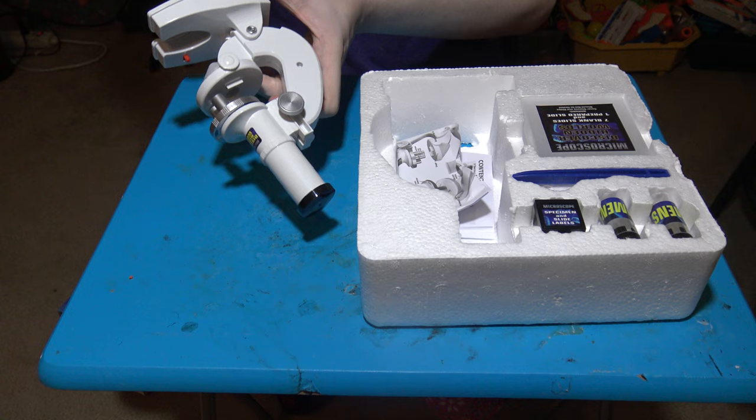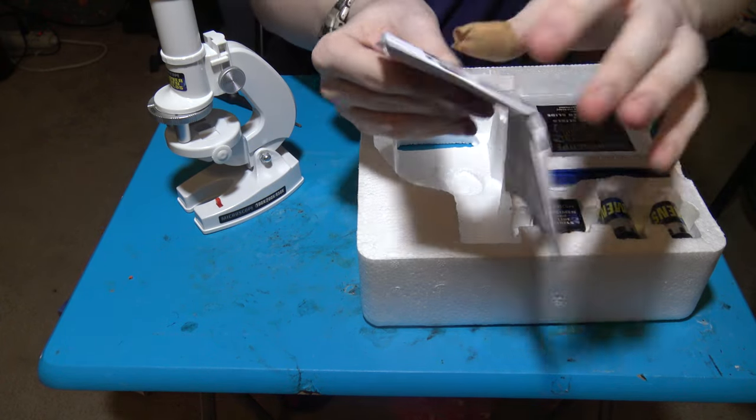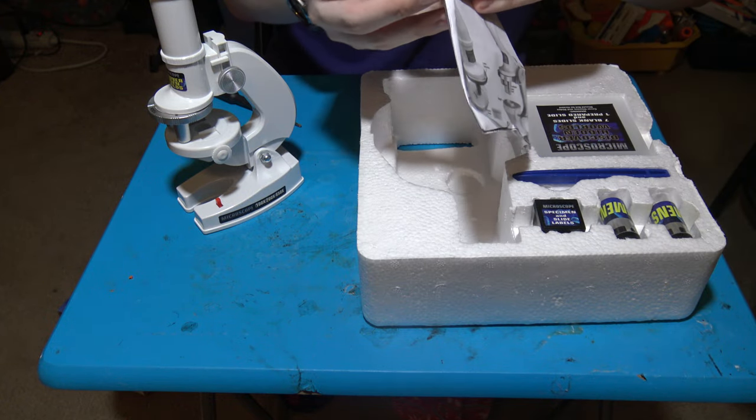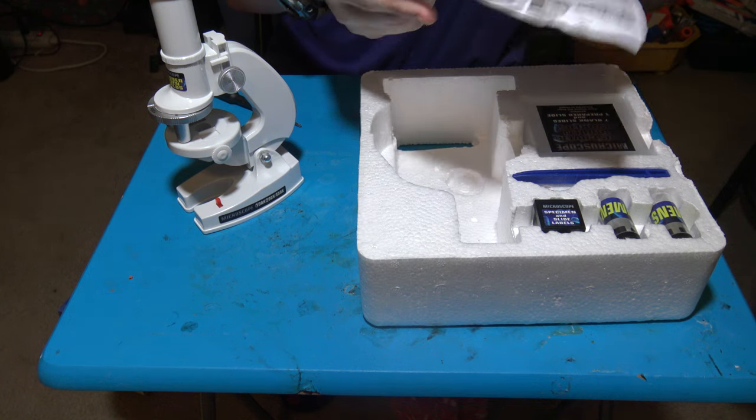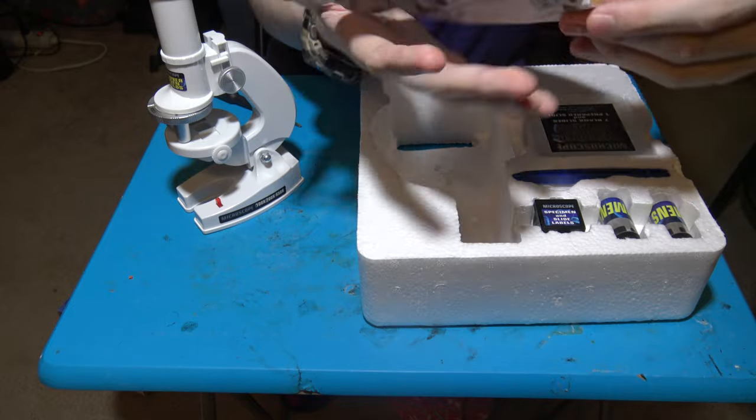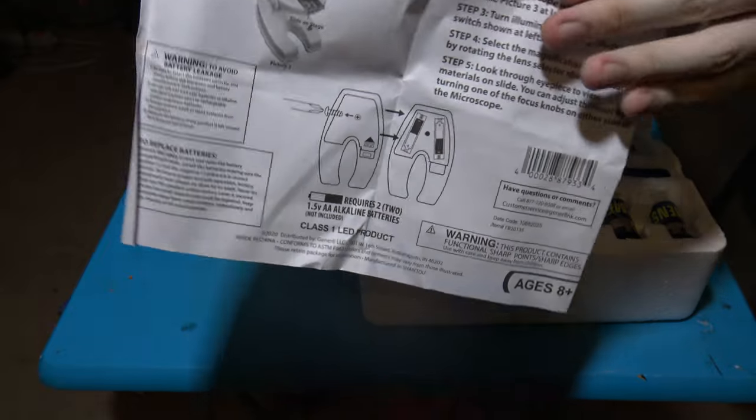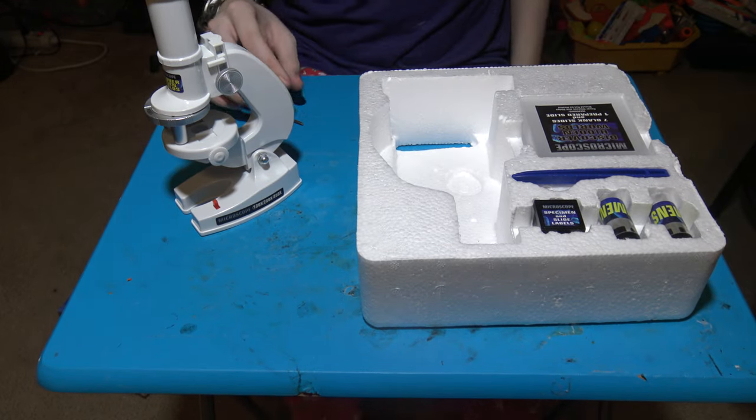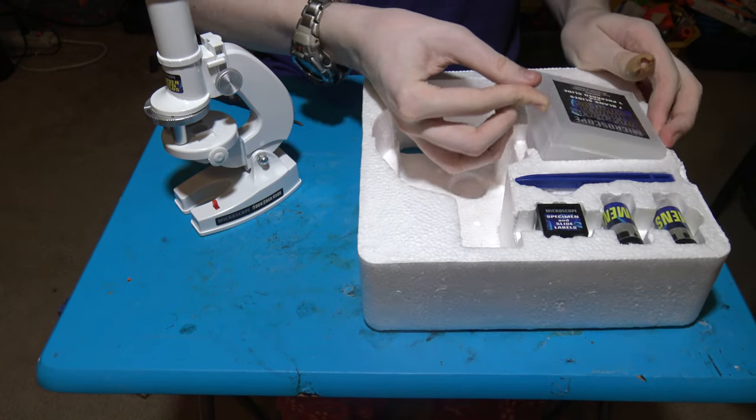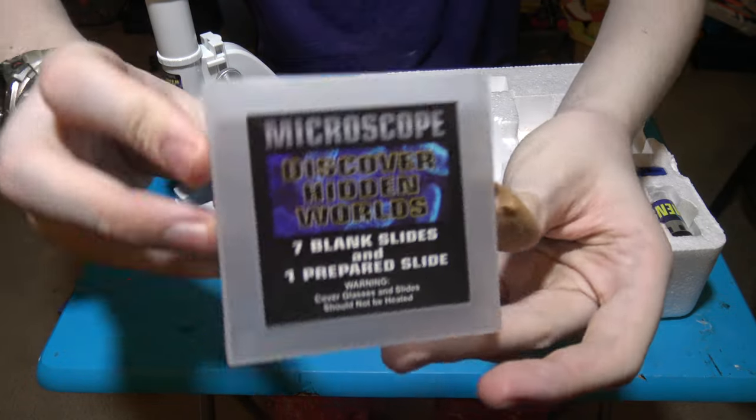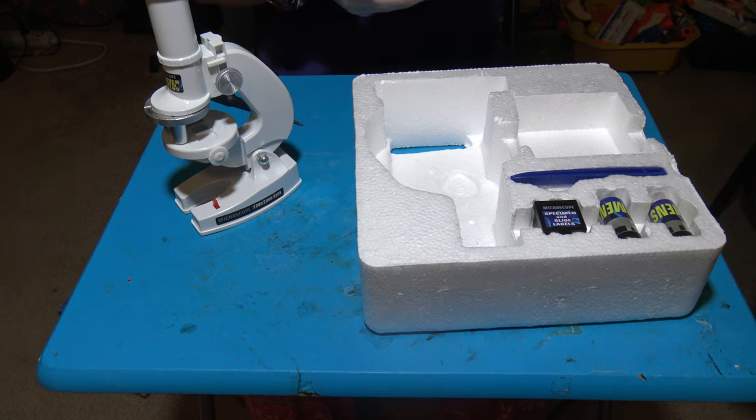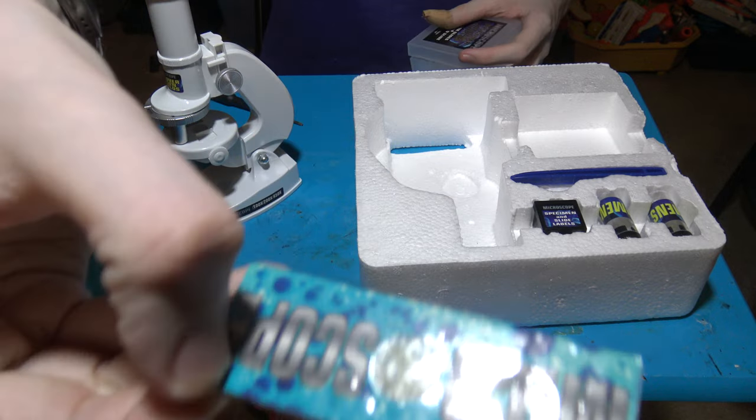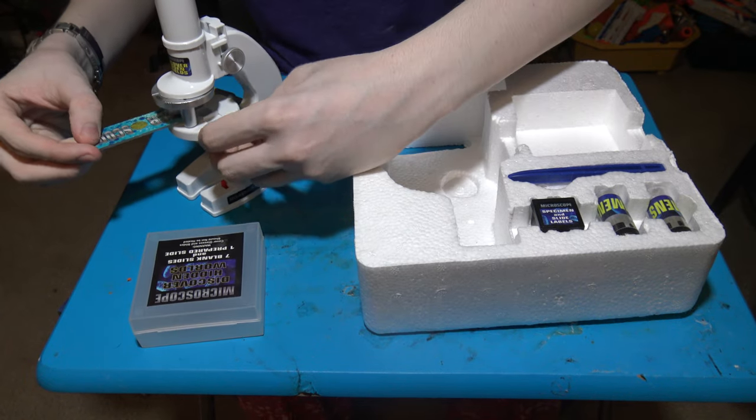Okay, got that in now. Time to see what it comes with. It comes with instructions, which I will leave in the box for the viewer that I'm going to send this to. There's the instructions for it. It says seven blank slides and one prepared slide. Here's the one prepared slide. I have no idea what it is. So, let's put it under the microscope.